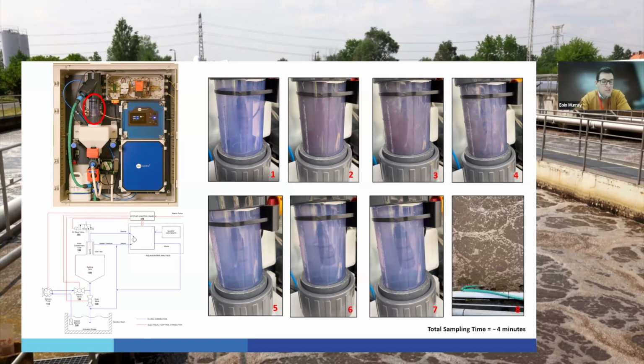Fluidically, what's happening is shown underneath, but the key events or the key things that are happening within the system really take place within the tubular setup highlighted in red there with the red circle. So what happens is a peristaltic pump pulls the aeration tank sample into the system. It fills the container, and the steps of events are captured here, 1 through 8.